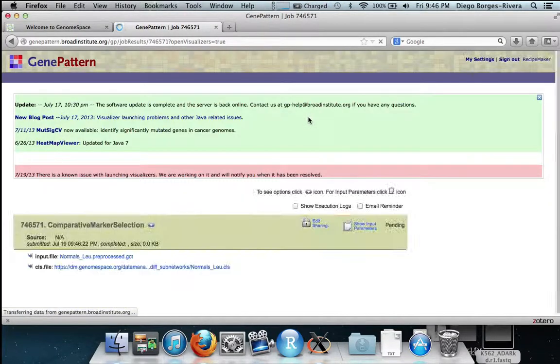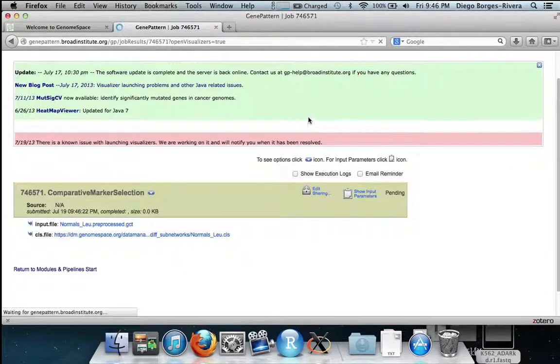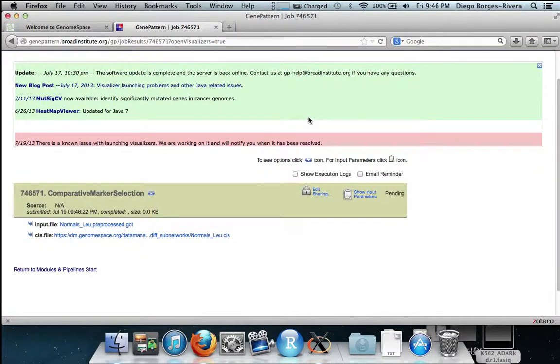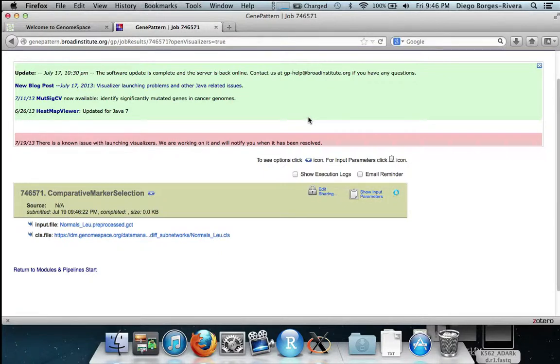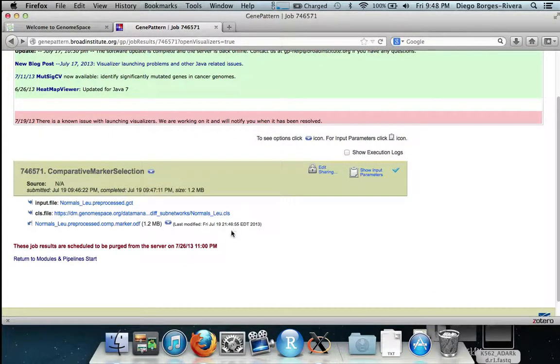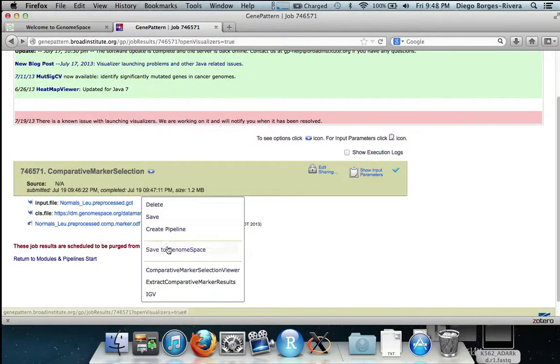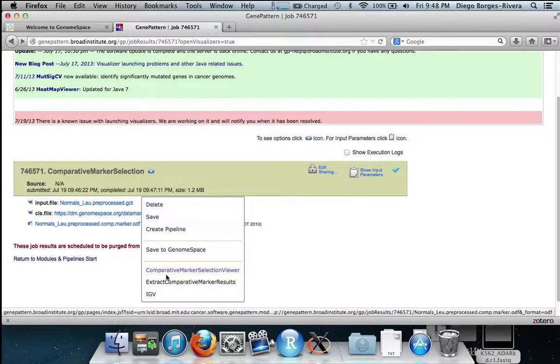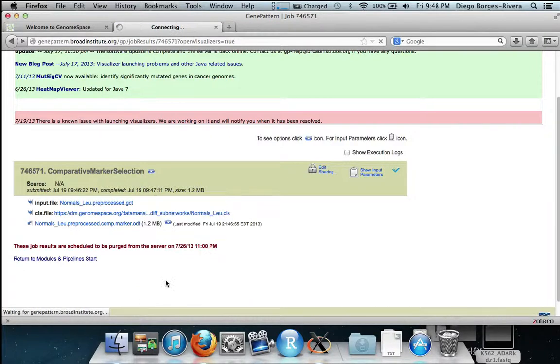After this is done, we now can send the output to extract comparative marker results. This will allow us to fetch the differentially expressed results. This is done by hitting the arrow and sending to extract comparative marker selection results.